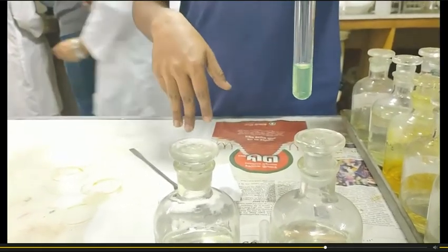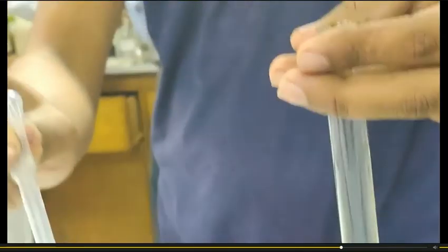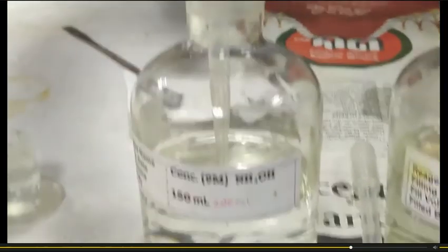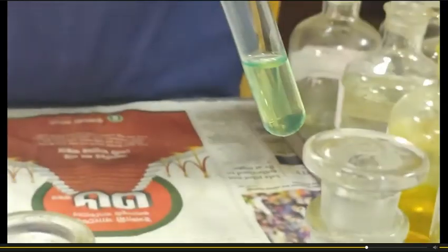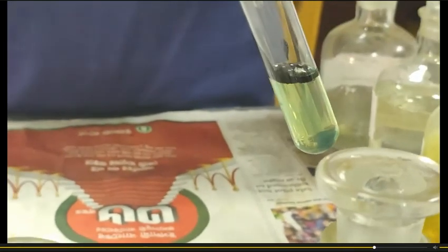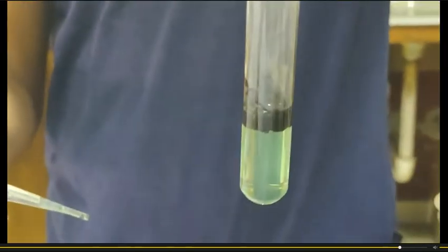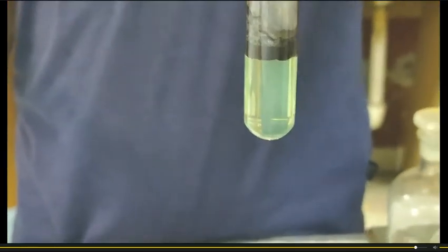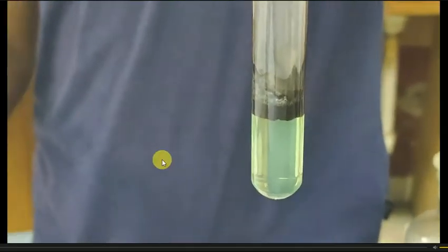Now into this hydrogen sulfide containing test tube we are going to apply ammonium hydroxide, 9M ammonium hydroxide. If group 3 is present, then there will be a precipitate. There is a black colored precipitate, indicating the presence of group 3 cations, and this indicates the presence of group 3 cations. That's all for the confirmatory. Hope you have understood how the group 3 cations are identified. This is the group test for the group 3 cations.